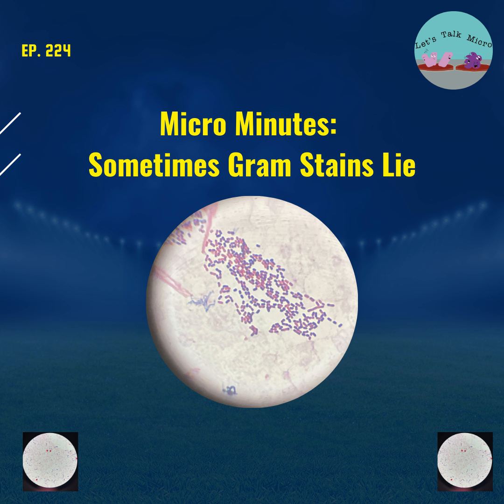One of the first episodes that I did in this podcast was about Gram stains, where we went through the whole process. So I invite you to check it out if you're a student or want a quick refresher. I'm not going to spend time on the procedure, since by now we have discussed that. I'm going to be talking about things you see in the microscope.